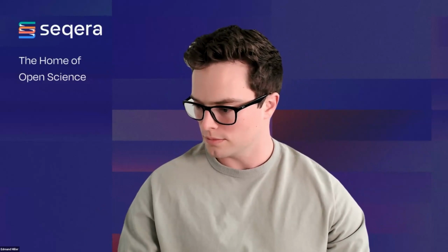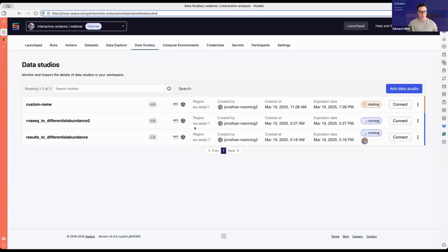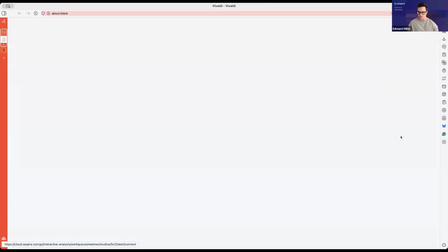Yeah, so just going back to my roots here a little bit. Did an undergrad in biology. So we're just going to play that I am the wet lab scientist who has run this. John's now set up this app for me. And I'm going to connect.